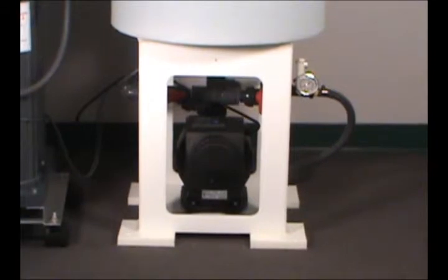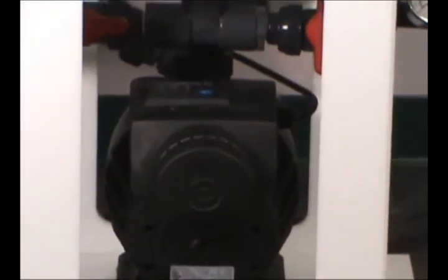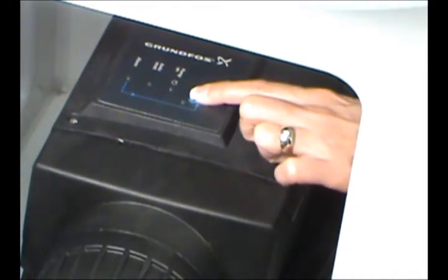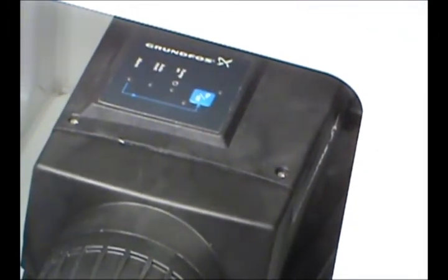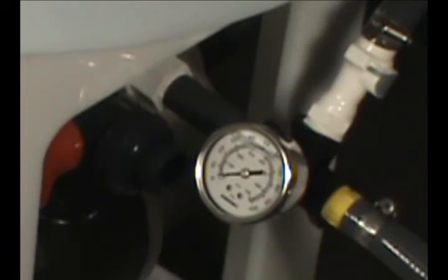The heart of the storage tank is the demand pump, located below the tank. This high efficiency pump operates automatically to provide water to your usage points. A clearly marked manual on-off switch is located on the top of the pump. An alarm light on the pump control alerts you to potential overload conditions such as dry running or excessive temperatures. The pump will not operate until the alarm condition has been rectified. The pump's outlet is monitored by a pressure gauge showing water pressure to your usage points at all times.